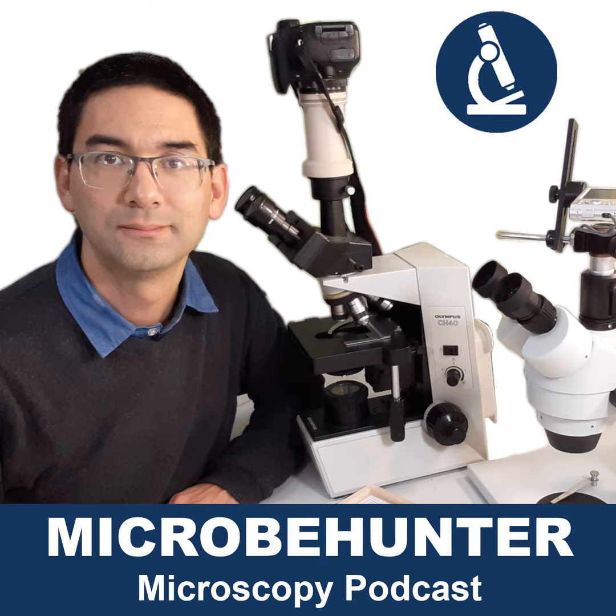What is not common at all, and what I actually think is very, very rare and even for good reasons, is for microscopes to have a built-in screen. Okay, I know there are a few microscopes I've seen. These are more in the toy microscope direction that have built-in LCD screens where, instead of eyepieces, you can directly look at the things that you want to look at using a small computer screen.